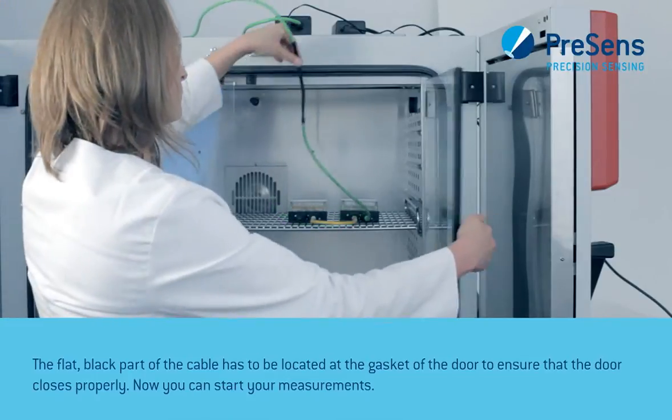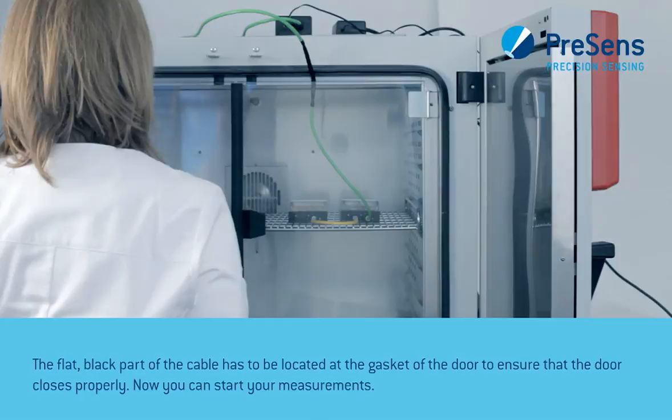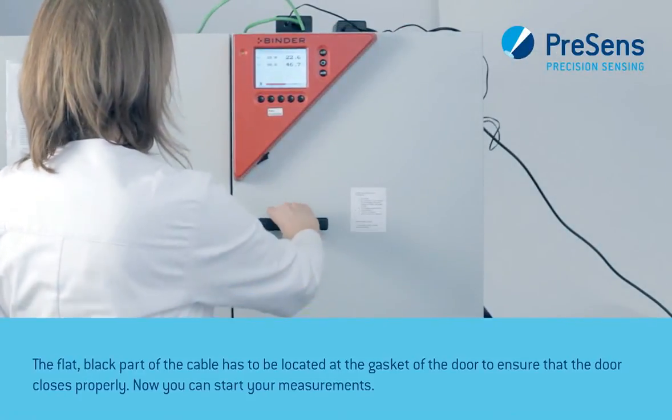The flat black part of the cable has to be located at the gasket of the door to ensure that the door closes properly. Now you can start your measurements.